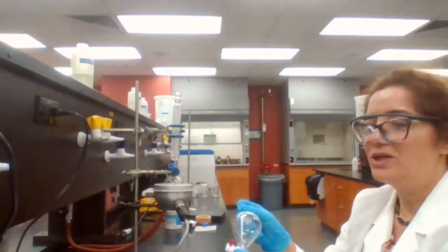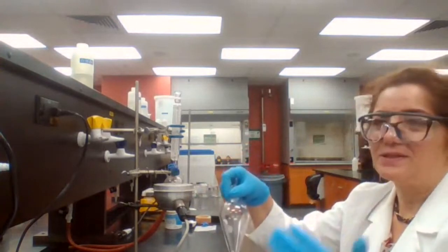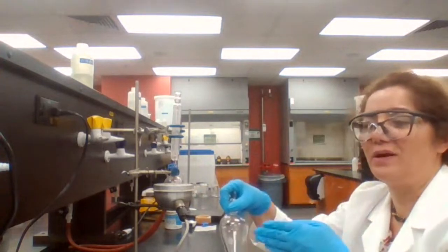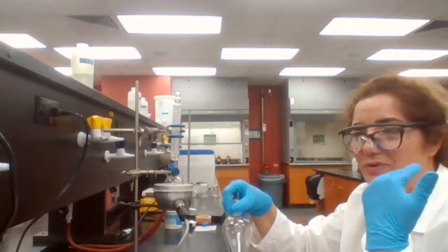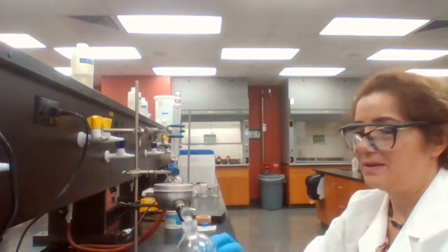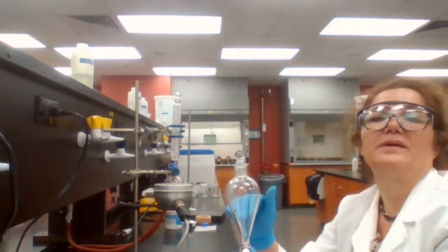You shake it, vent it, and separate. So shake it, vent it, separate. Shake, vent, separate. Those are the three words that should come right after one another, one after the other. And it kind of rhymes, and you have to remember it that way. Because if you add sodium bicarbonate the first time, you shake it, you vent it, and you don't separate.